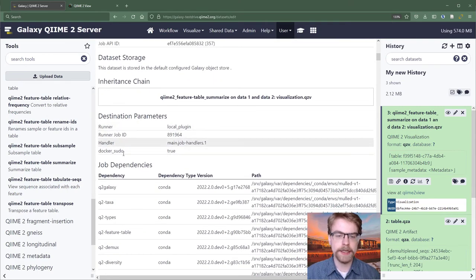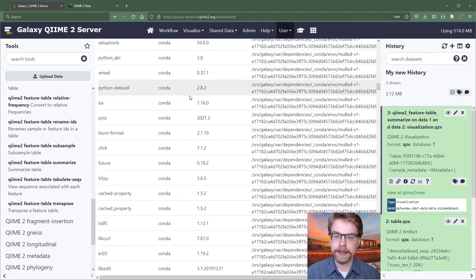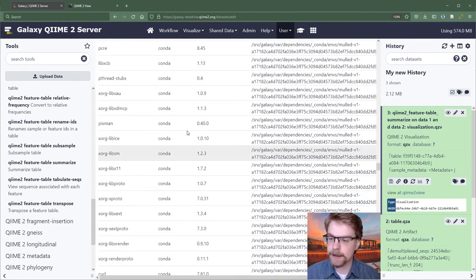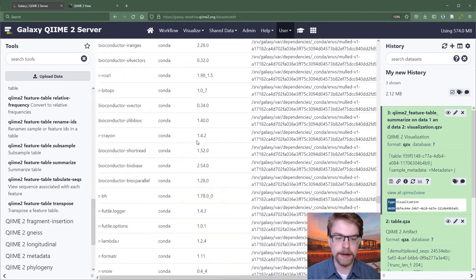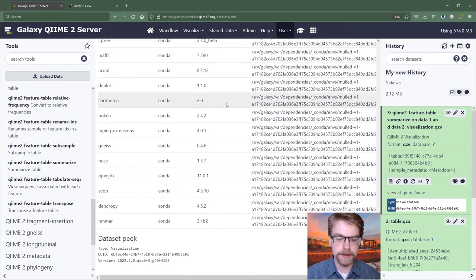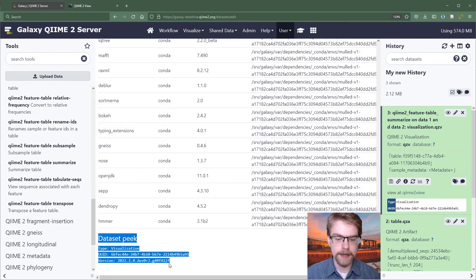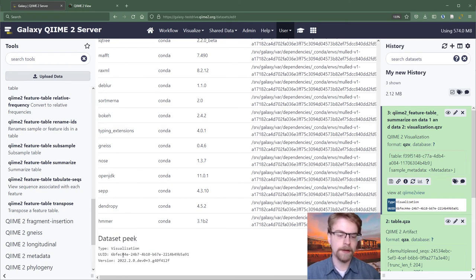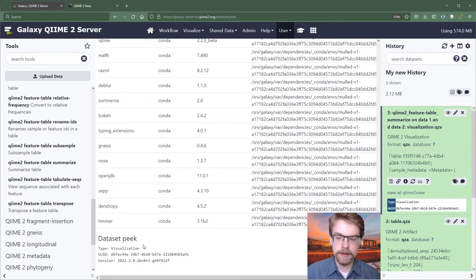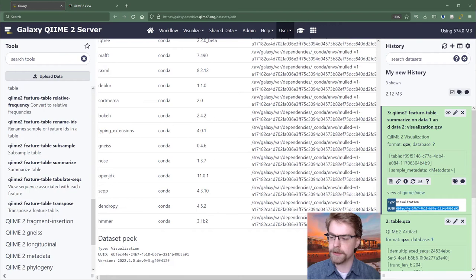Elsewhere, we see a bunch of metadata that really isn't too exciting. We have a lot of package dependencies you can see here. We also have at the bottom a data set peak. And so this is kind of the nitty-gritty detail. You can also see that over here. And so these are the two more important elements.